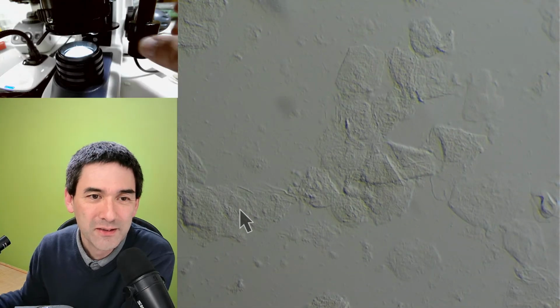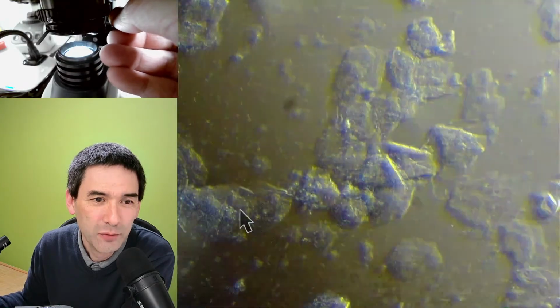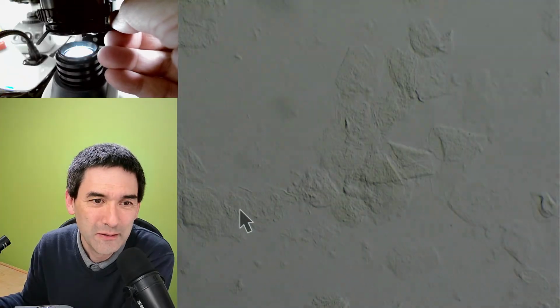So in other words, if your microscope has this swing-out filter holder, you just try to put it in a little bit, and then you get oblique. And if you do it further, something like this, then you even get dark field. And again oblique.